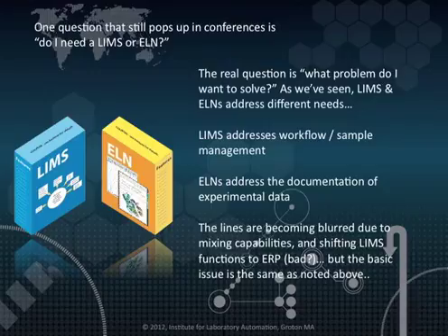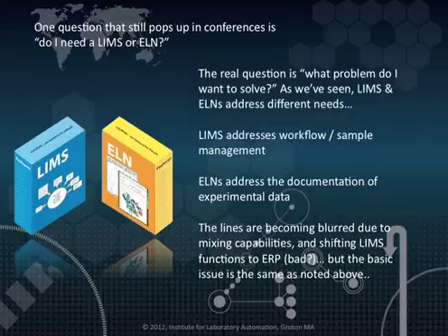One question that pops up frequently is whether the need is for a laboratory information management system or an electronic laboratory notebook. The real question should be, what problem do you want to solve? The software packages provide different capabilities addressing different needs. The lines between packages are being blurred due to mixing capabilities and efforts towards shifting laboratory information management system functions to ERP packages. This latter point can be a bit of a problem.